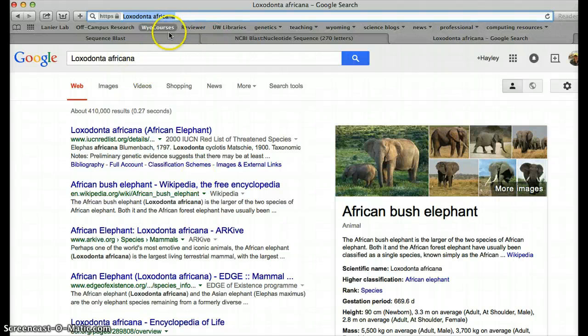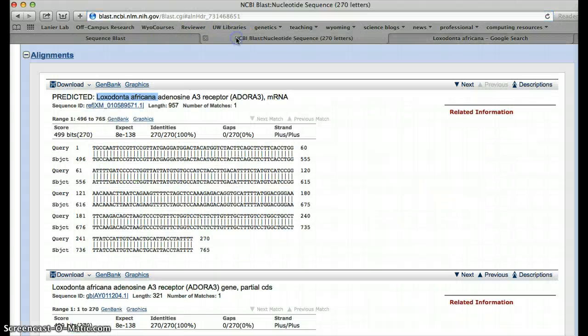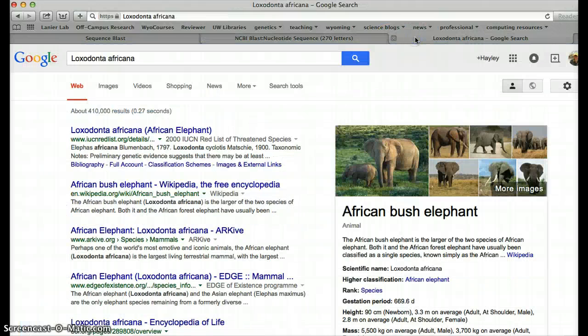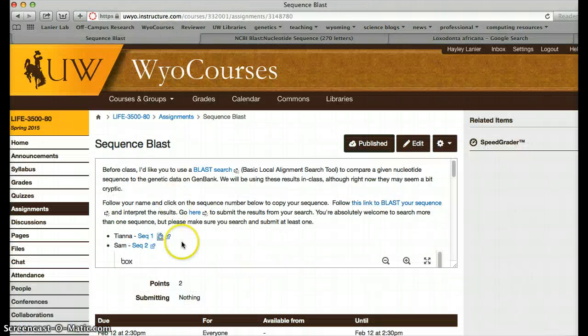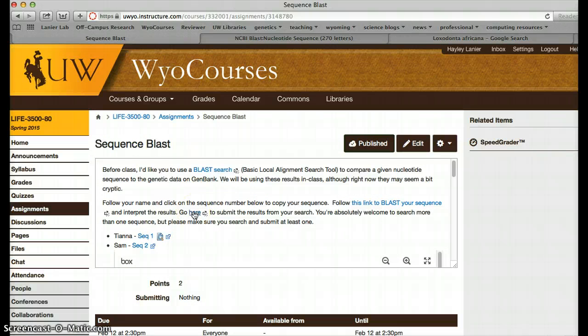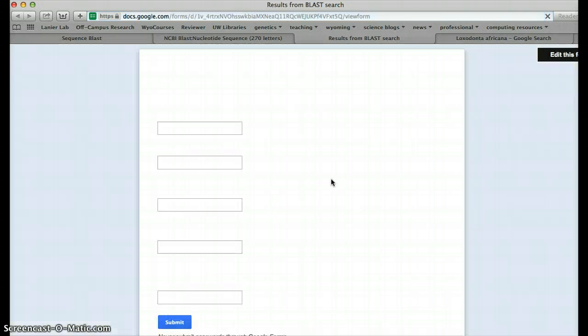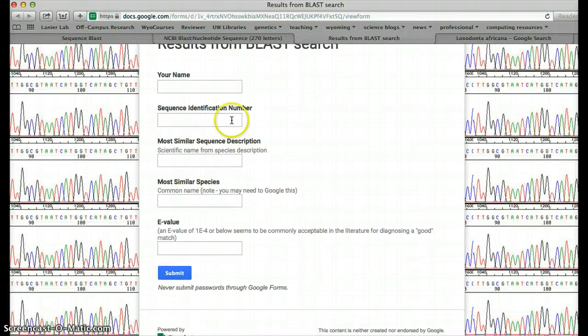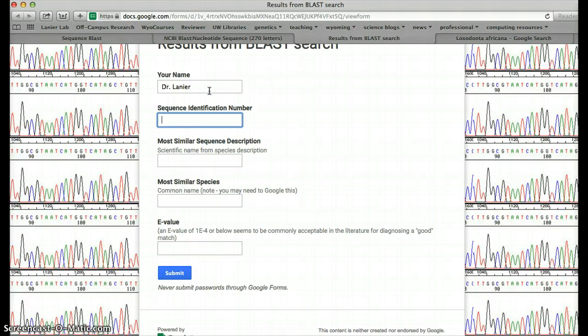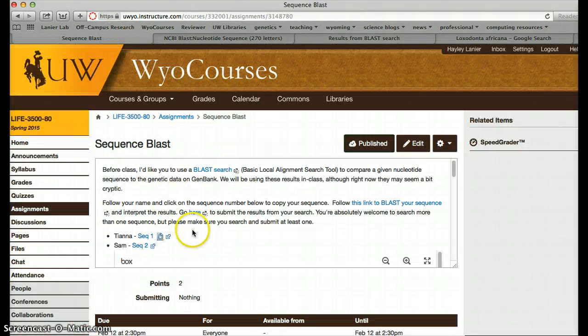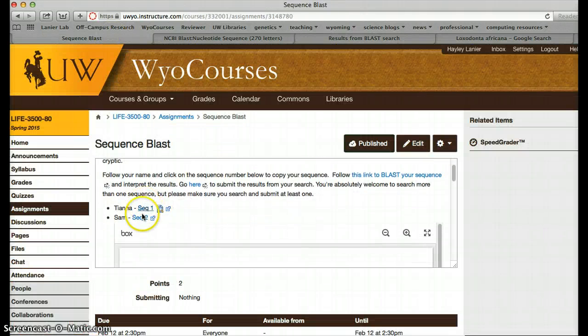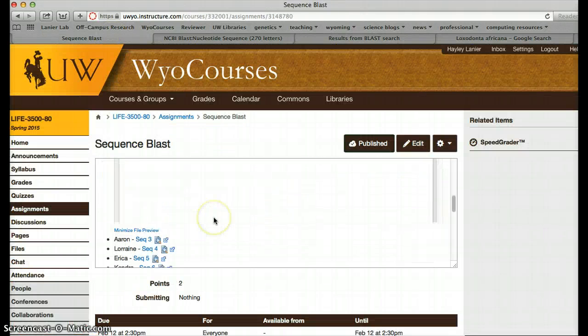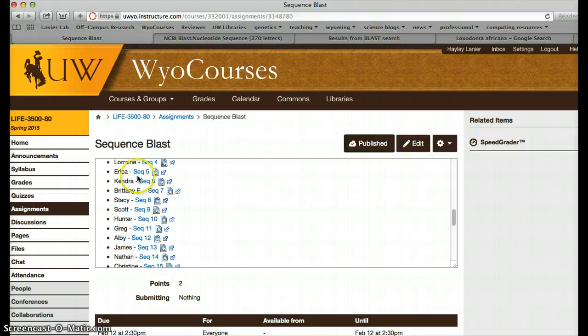Alright. So what we've done is we've run a blast search. We've got a common name for it, and now you need to report out that information. So just like last week, you're going to click go here, and that's going to bring up yet another window that will let you report the results from your blast search. So you'll put in your name. You're going to put in your sequence identification number. That's just going to be sequence 1, sequence 2, sequence 4, sequence 6.